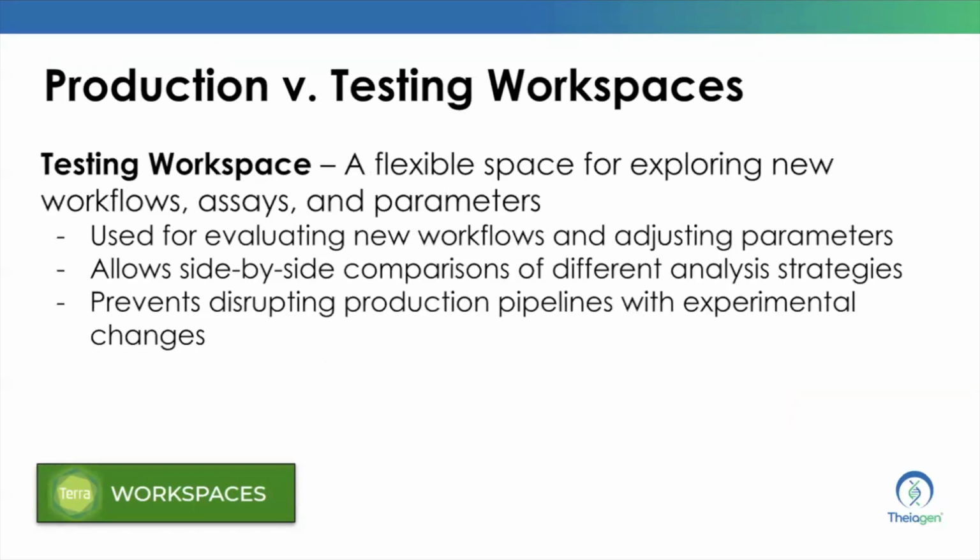Testing workspaces, on the other hand, are meant to be more flexible and exploratory. It can be used for evaluating new workflows and adjusting parameters. It also allows for more side-by-side comparisons of different analytical strategies. In a testing workspace, this may be where you want to adjust parameters to assess the impact on your results.